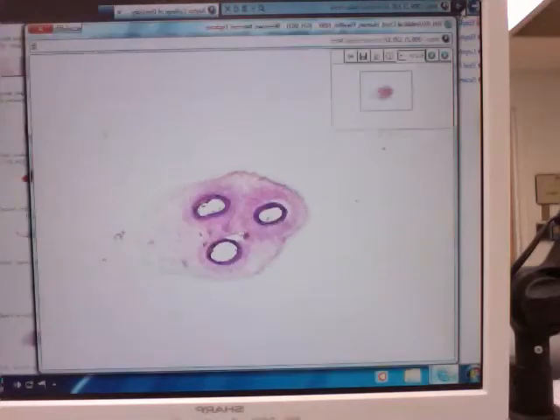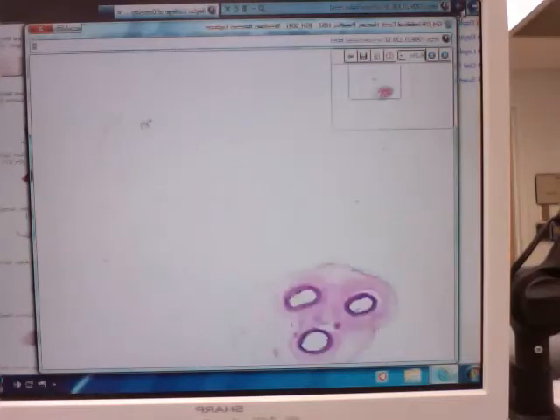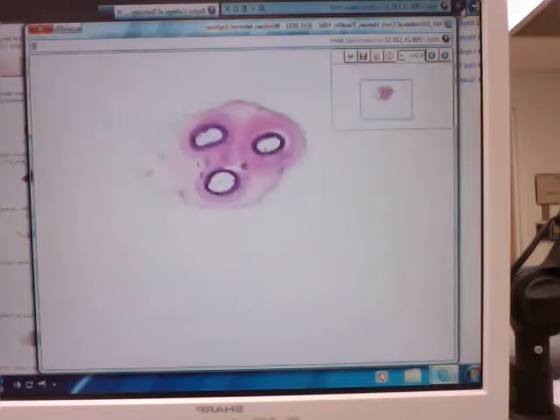Some of the cells on that last one kind of look like they're in lacuna to me. Whenever there are lacuna, would they be more defined? Question was, some of the cells there look like lacunae.